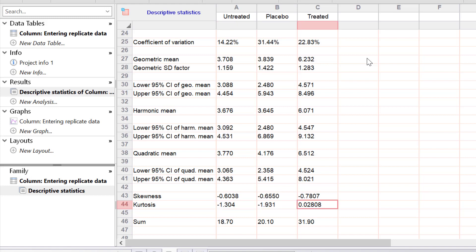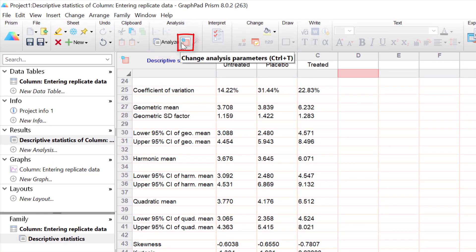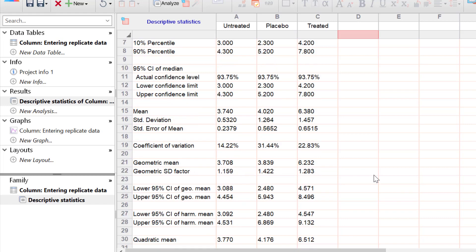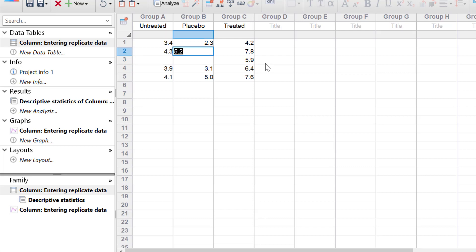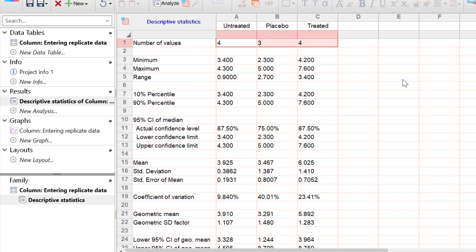As well as running skewness and kurtosis descriptive statistics, it's always best to run a histogram to assess each one visually as well. The final parameter is the sum — the sum of all data points within each group. The good thing about GraphPad is that you can go to the Analysis tab and click Change Analysis Parameters to check and uncheck any option you wish, click OK, and the data sheet will be automatically updated. Similarly, if you go to your data table and add or delete data values, the result sheet updates automatically — so you don't have to re-run the analysis.